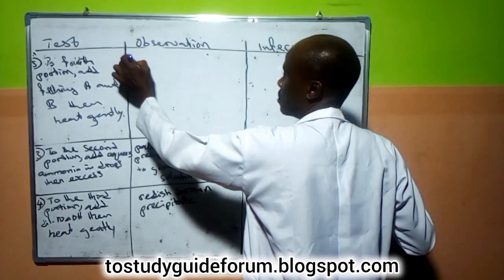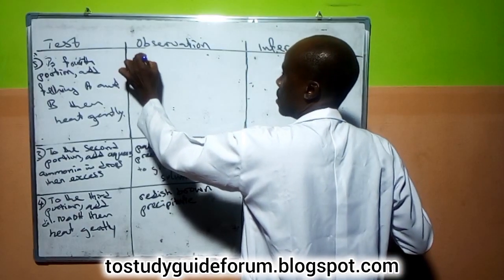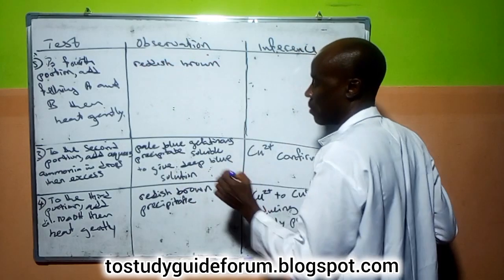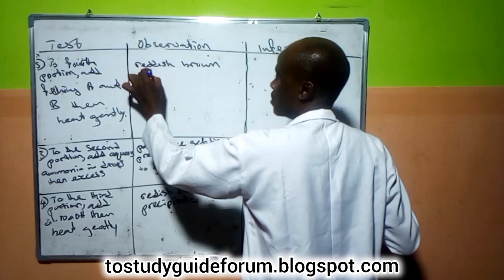There is a brownish, reddish-brown precipitate.